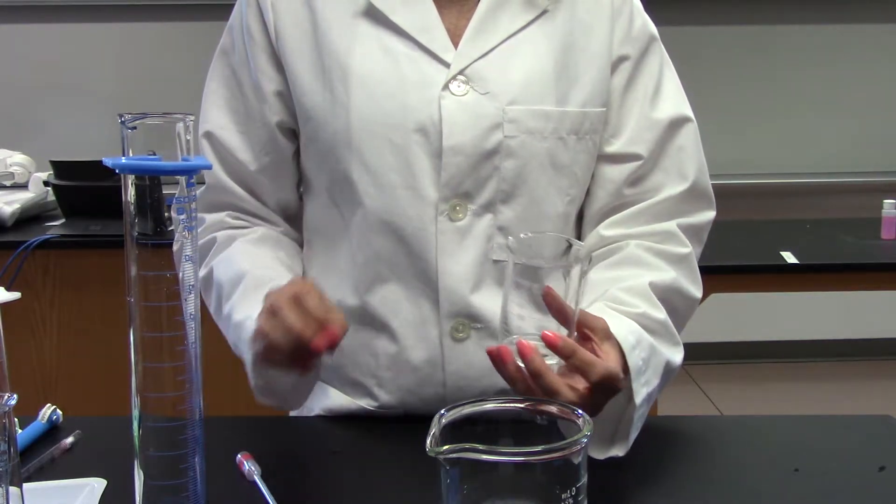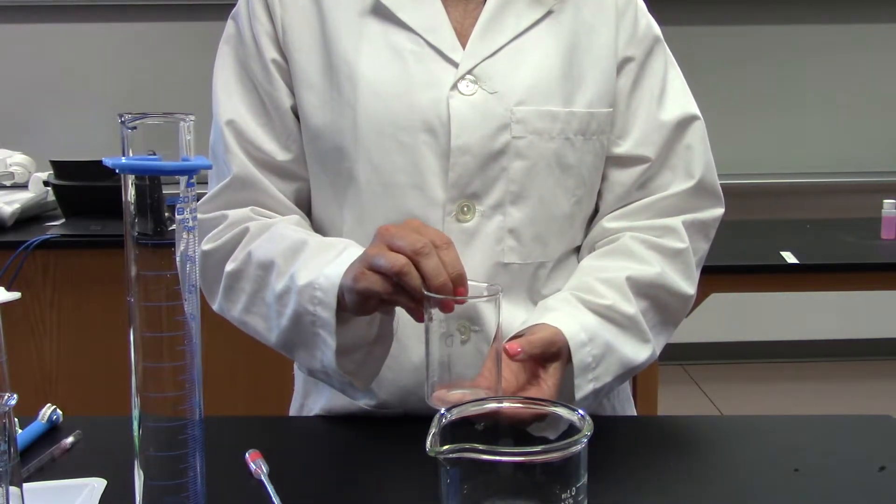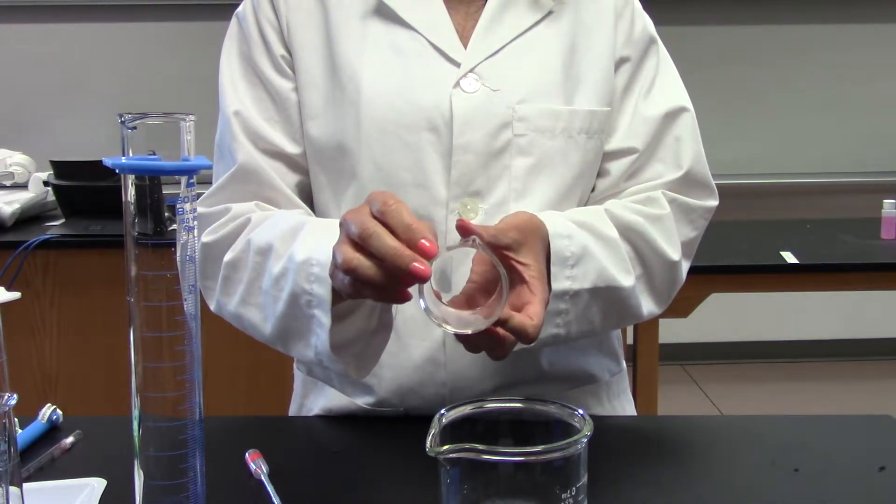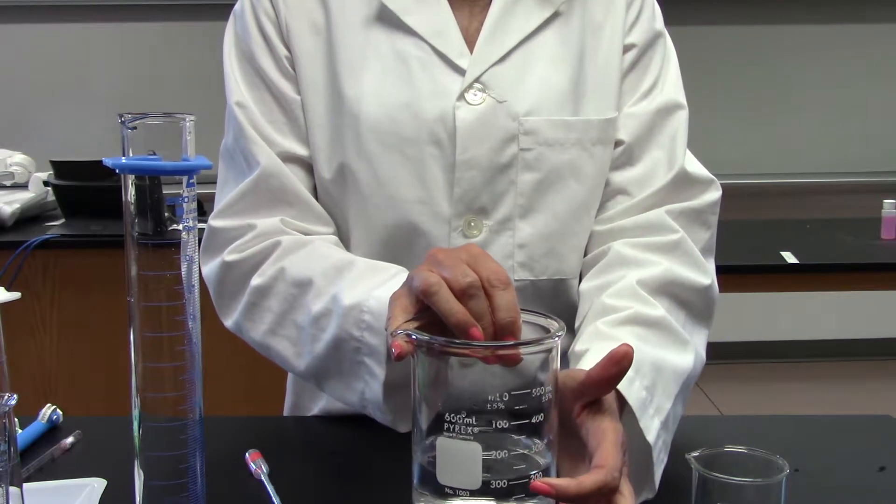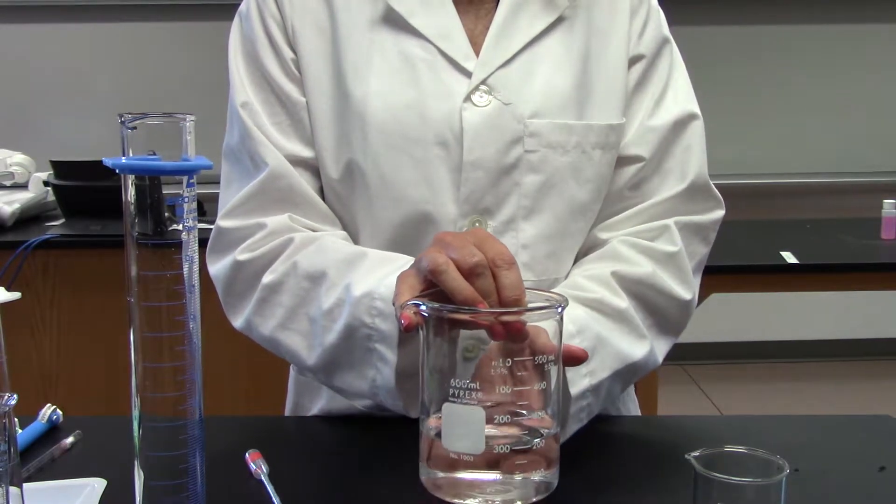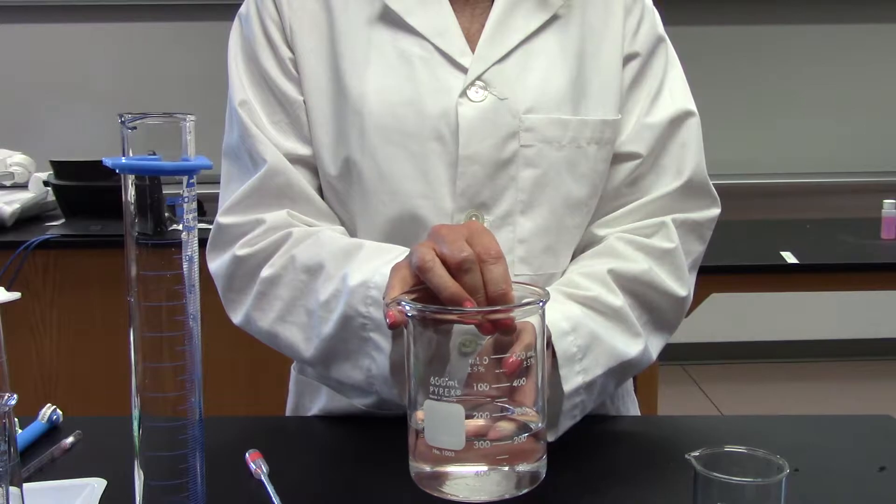But I would not want to use this to measure liquid volume. The reason for that is it has a big wide mouth and the graduations on the glassware are pretty far apart, so it's just not as accurate as some other choices I could make.